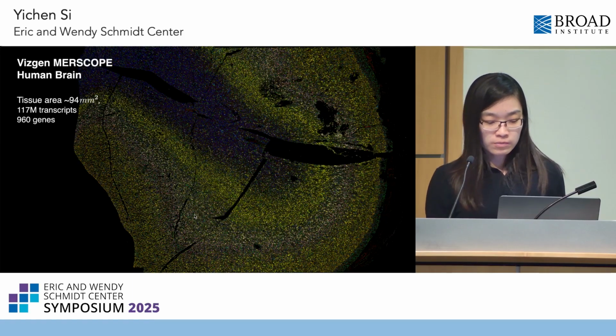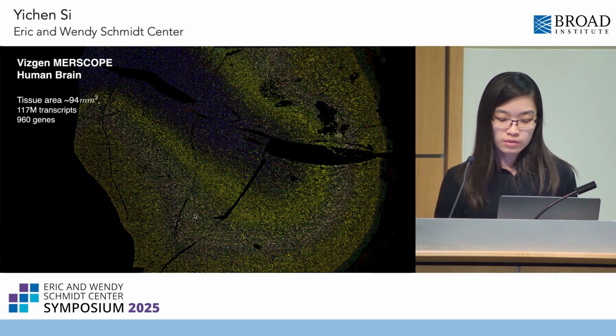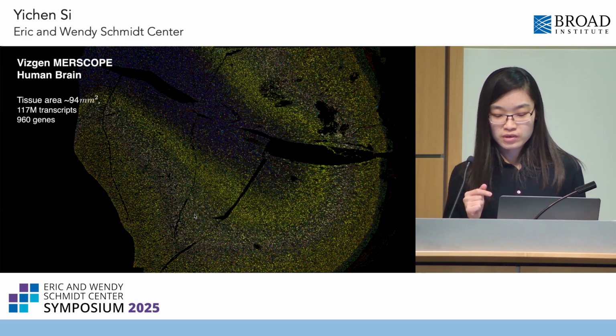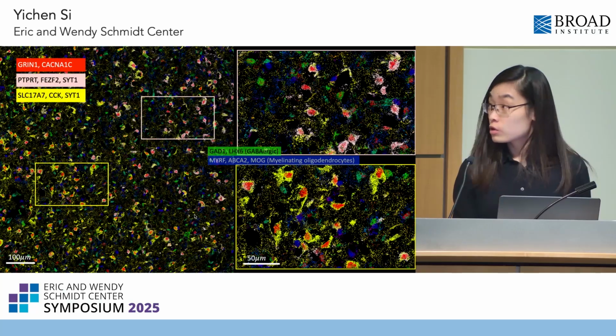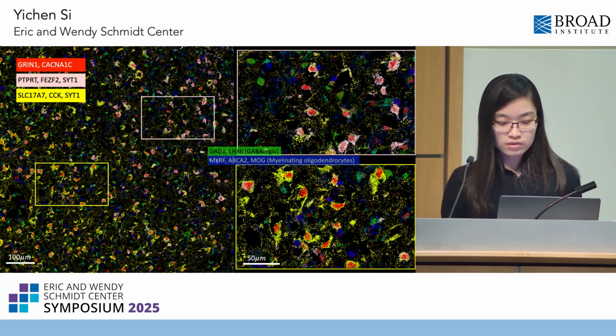We checked another public brain dataset from Merscope to see if we observe a similar subcellular pattern in a different technology, and from a human instead of mouse. Especially in this case, those nuclei markers are not available in the gene panel. So although the nuclear non-coding RNAs are not present, the model still seems to learn a soma-specific signature.